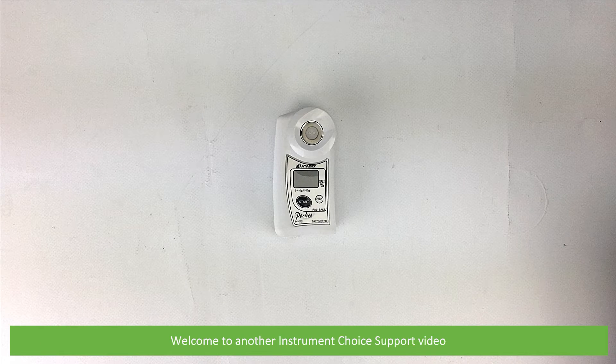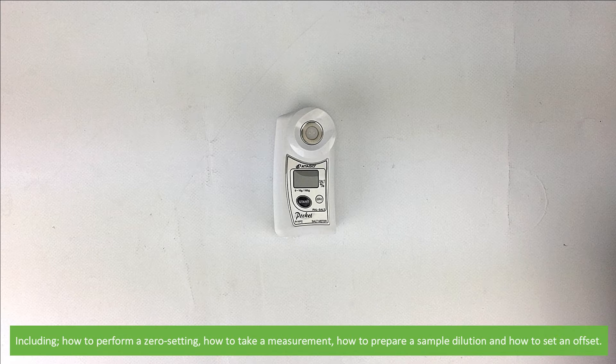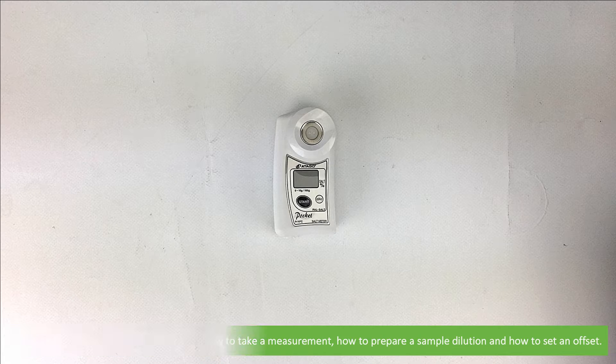Hi and welcome to another Instrument Choice support video. In this video we'll demonstrate how to use the PALSALT digital handheld pocket salt meter, including how to perform a zero setting, how to take a measurement, how to prepare a sample dilution, and how to set an offset.